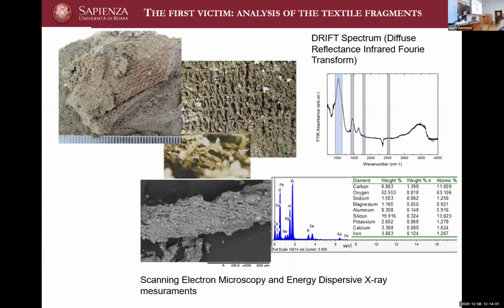The SEM analysis has shown degraded fibers that have entirely lost their original morphology. The investigation with energy-dispersive X-ray and FTIR gave preliminary insight into the type of mineralization of the fibers due to the mineral content of the pyroclastic material, whereas the spectroscopic analysis added information related to the presence of highly degraded organic compounds. Further research is needed, of course, but the peak and stretching bands detected suggest the degradation of cellulosic fibers.